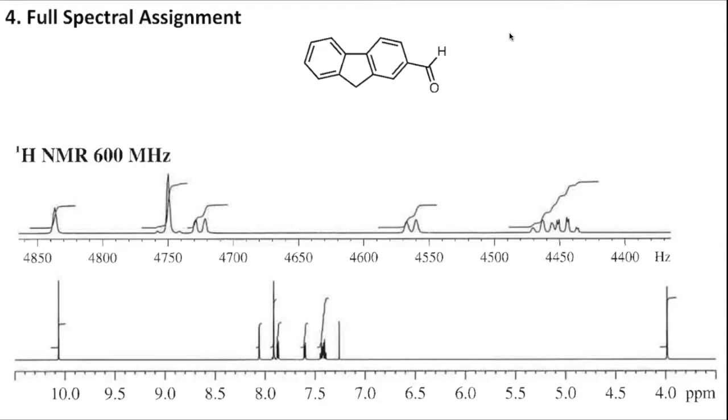Now, this is the strategy that I like to use. If it feels better to you to start diving into the one-dimensional NMR and immediately making some labels on the structure as you go, feel free to do that. Like I say, there are a ton of different ways to approach these problems, and you want to choose the way that's going to work best for you and your lab team.